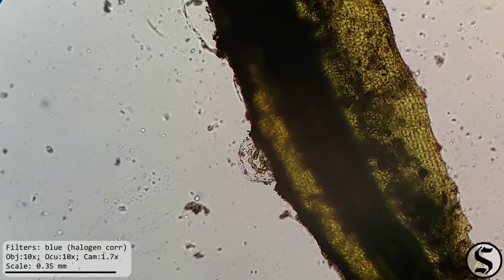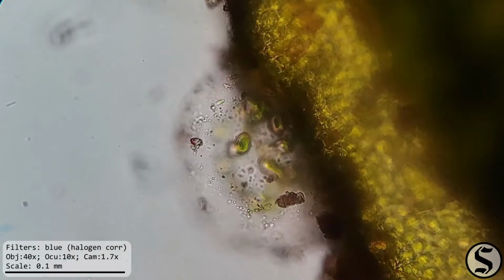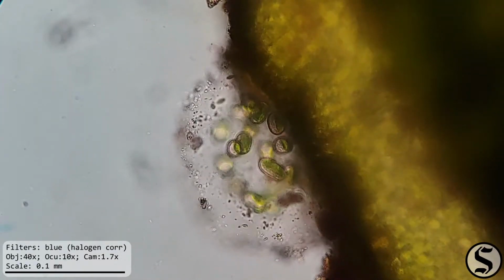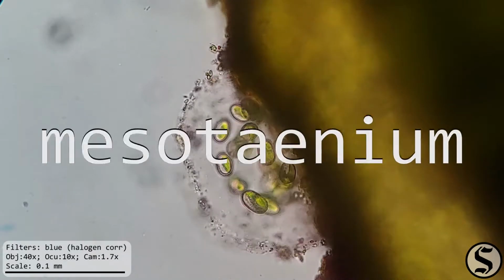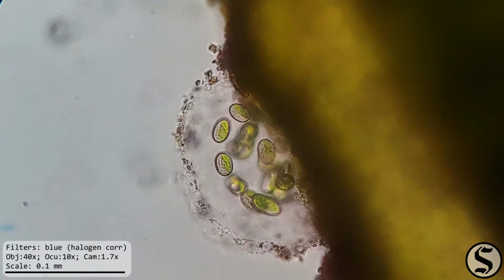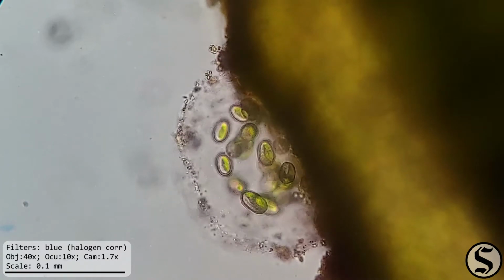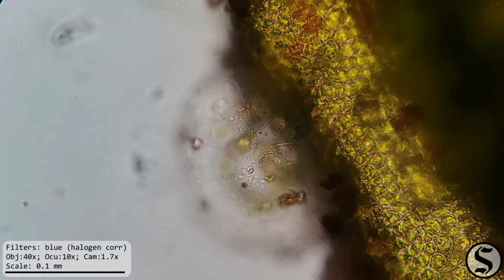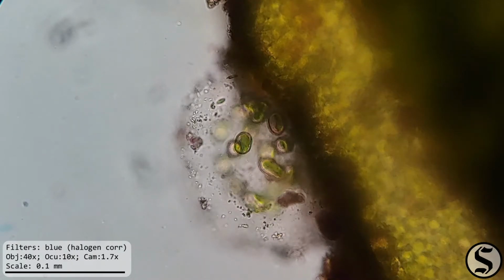Now, after a lot of research, since there are a lot of types of green algae, I believe that this is of the genus Mesotaenium. That comes from the Greek mesos, meaning middle, and Latin taenia, meaning ribbon, because it's got that sort of ribbon-like chloroplast in it.